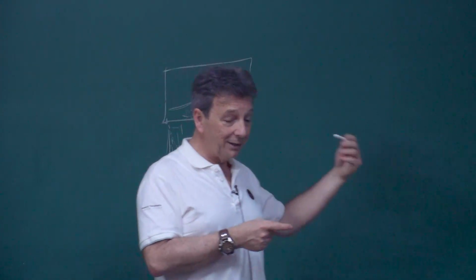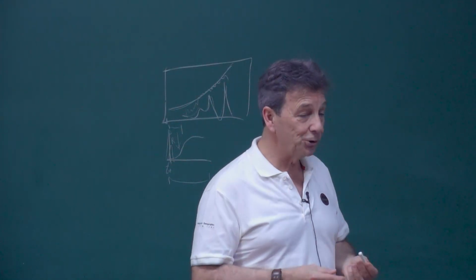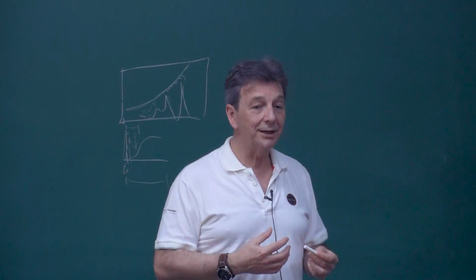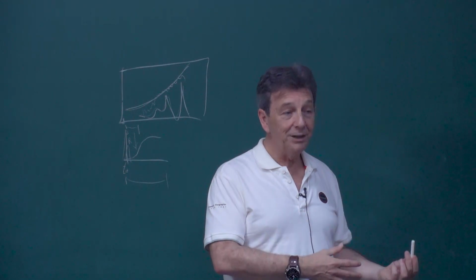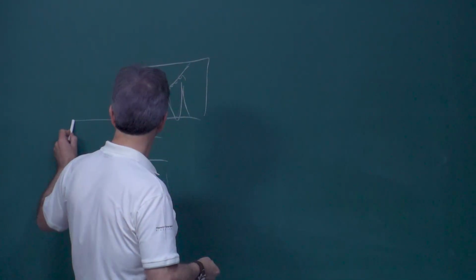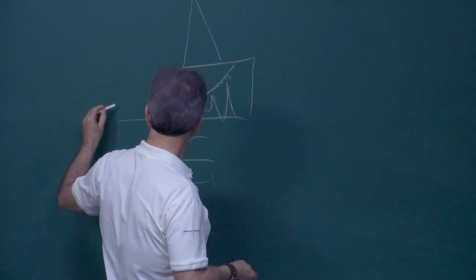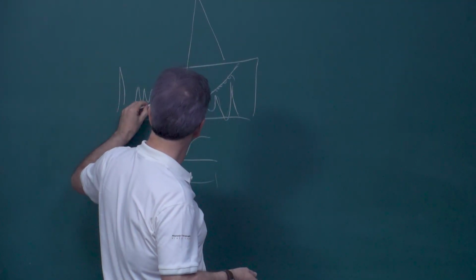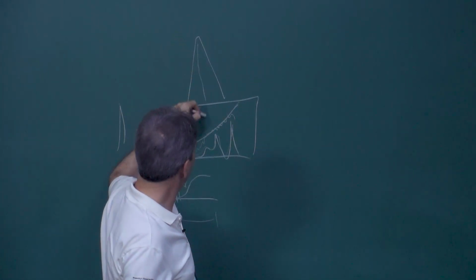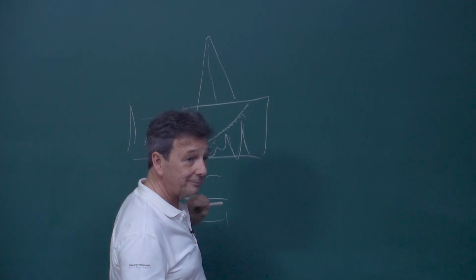Those systems are becoming increasingly affordable. Spectral resolution is not very good, but it's a very elegant, very smart approach, which helps you look at almost any sample without worrying about the fluorescence problem. The other option is to go to a UV laser. The fluorescence will be huge, but it doesn't matter. Your laser is here and your Raman peaks are here. Even if the UV makes a much stronger fluorescence, you're working here.